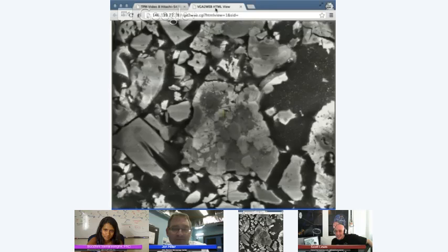Thinking about the scale of this. It's hard to see the crosshair. It's a funky green color, but the problem I have is I can't be at two microscopes at the same time. So we're actually remotely pulling in the feed from the microscope from a different lab. So I have to apologize for that. I'm pointing my mouse cursor right here on the center of the crosshair.